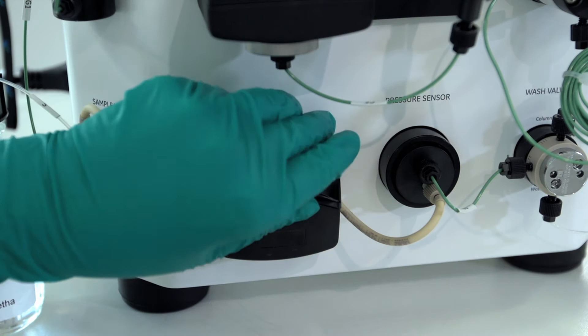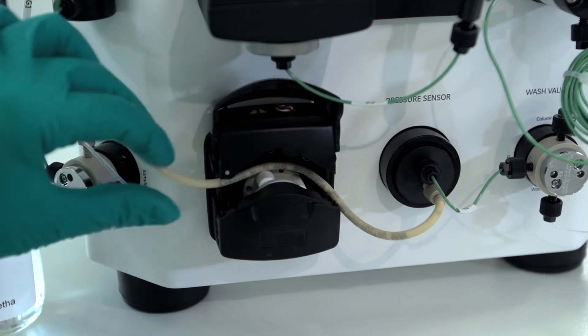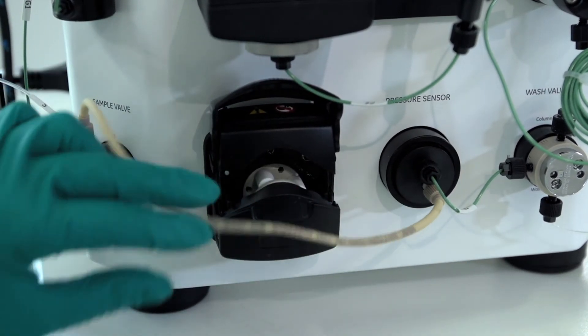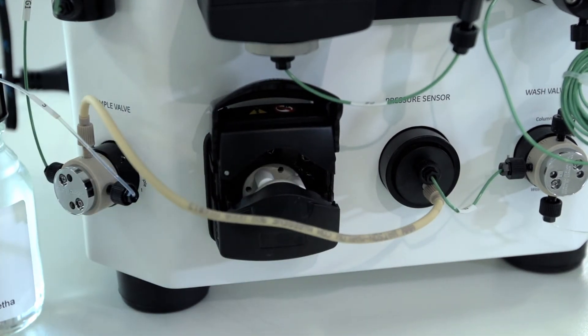For prolonged tubing life, ensure the pump lid is open when the system is not in use.